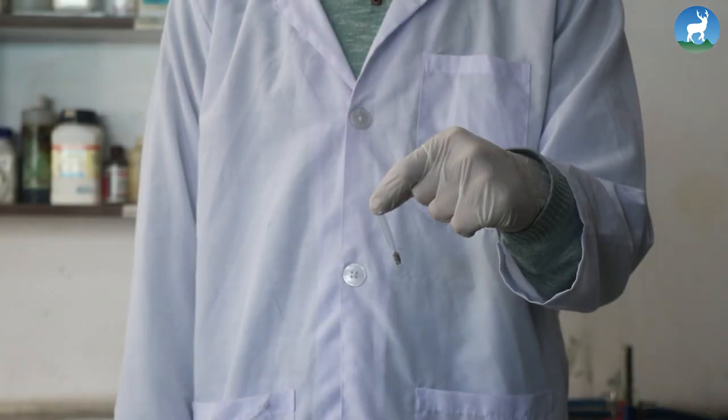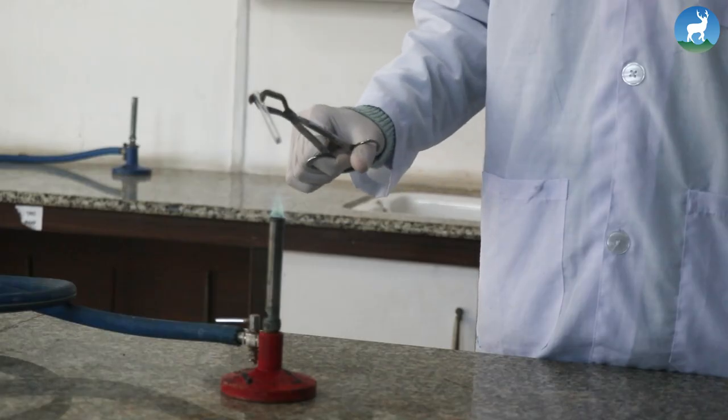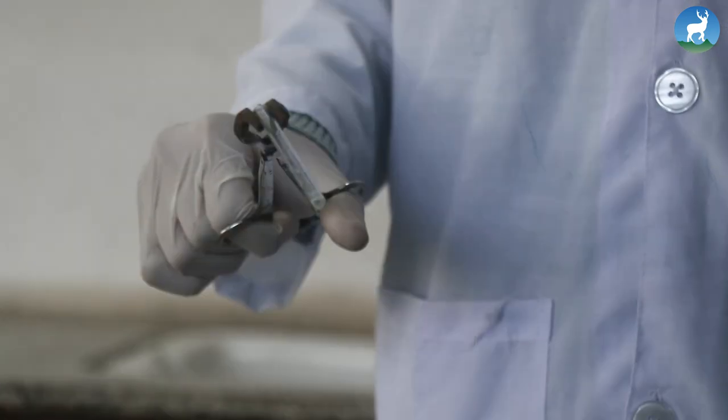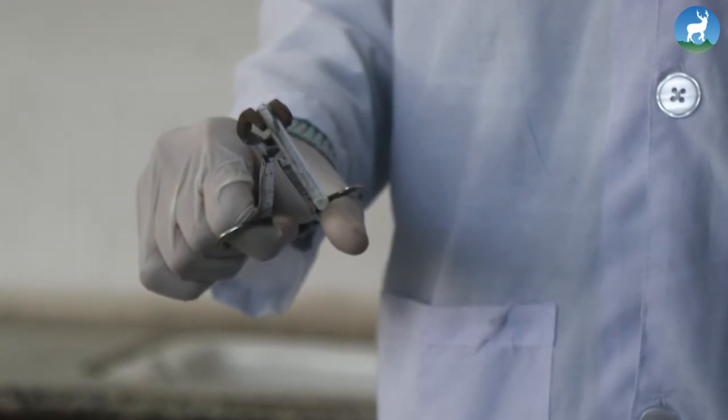Take a small piece of dry sodium metal in a fusion tube. Heat over the burner until it melts with a shining surface and cool it.